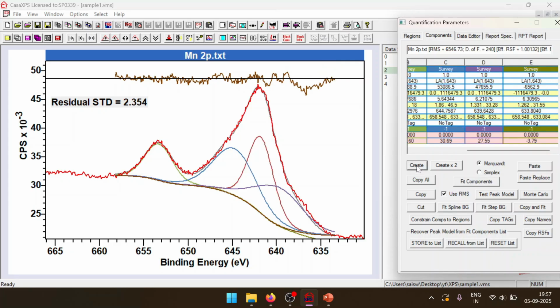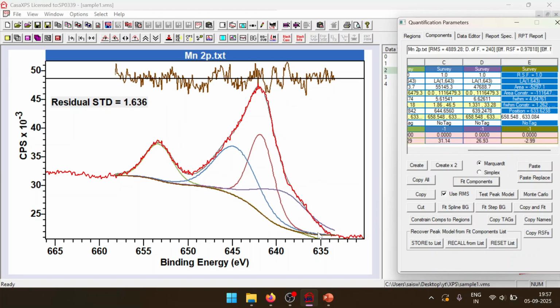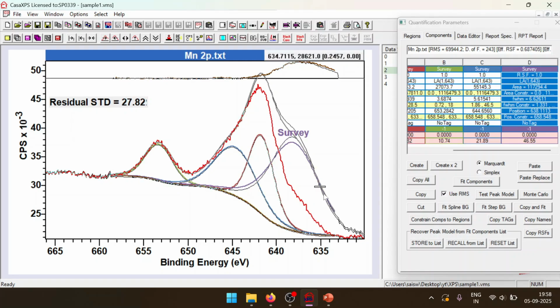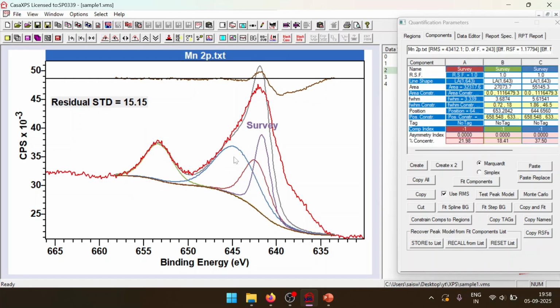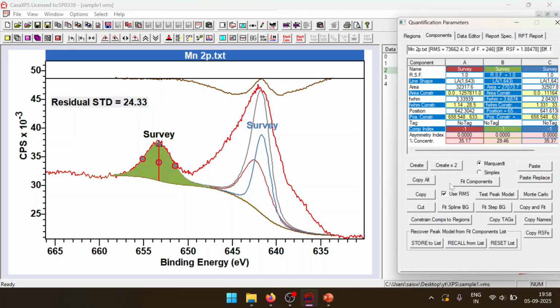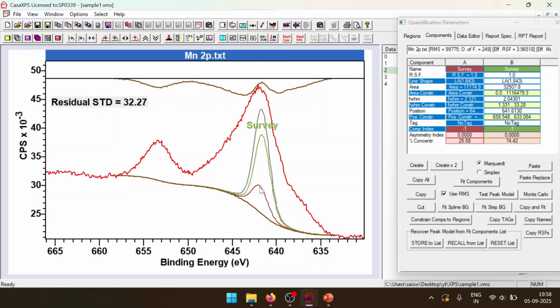Now another thing is whenever you fit some peak, let's say this peak is there. Okay, I'll explain with this purple peak itself. Whenever you do a fit, your peak should not come like this. This is already a peak. Let's say I'll remove the other. So you have one peak, the light green peak, then you have the red color one. This kind of situation should not happen because this is wrong. Your second peak should always have at least some area different from the first peak. They should not completely overlap, because this does not make any difference.